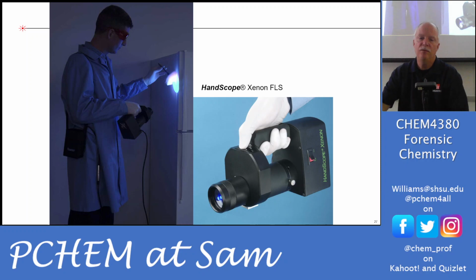So here's one of the xenon light sources. It's kind of bulky compared to say an LED. It's got the lamp housing here. You've got a fan inside this housing. It's got the xenon gas lamp in there. This right here is pretty nice though. This has your filters built in.